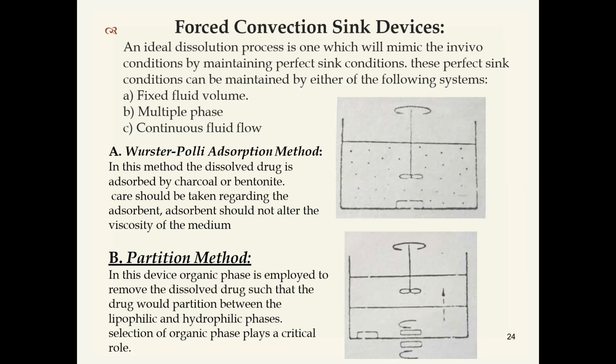Next one is the partition method. What is the partition method? This partition method was developed by Gibaldi and Feldman. It consists of a beaker and stirrer. In the partition method, partition will take place.